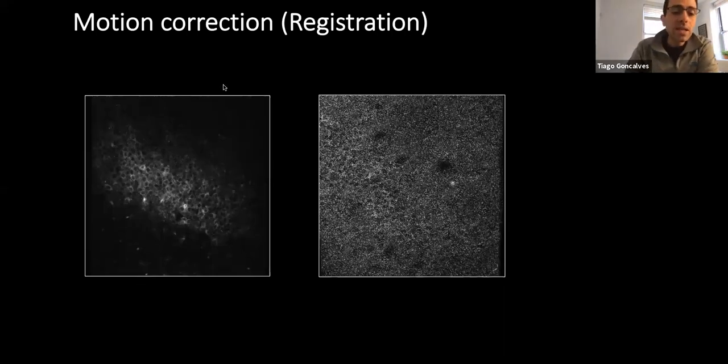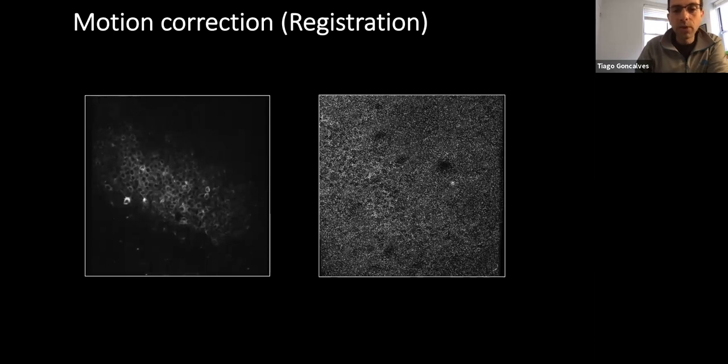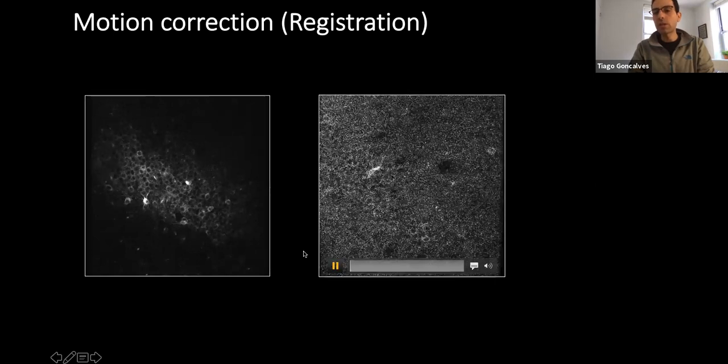Okay, with that said, we'll look at the first point, which is motion correction. Hopefully this video will show up fine. You see that this is a beautiful video of CA1, but every now and then, even though this is very, very stable, there is a little bit of motion. You see this shakiness just now? That's an example of very mild motion correction being necessary. This video has been corrected, and it actually had very intense image correction.